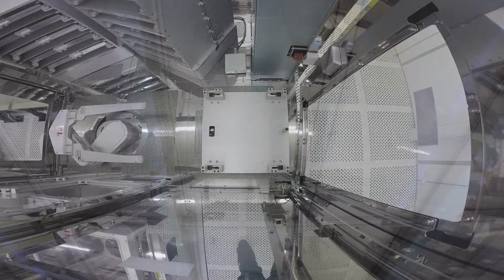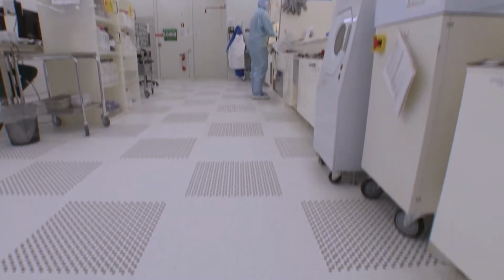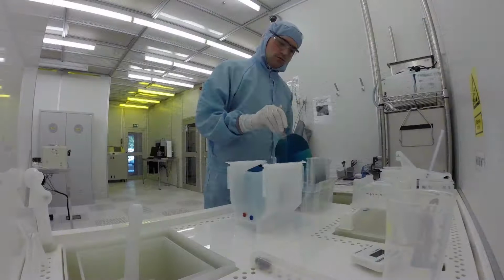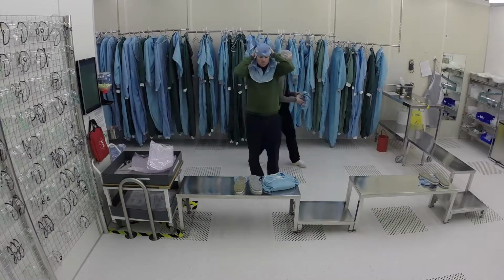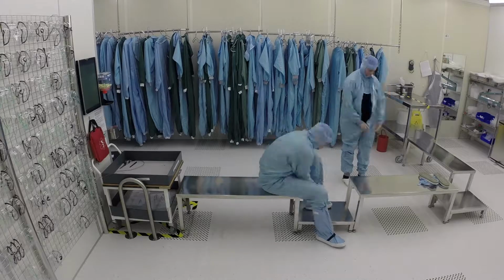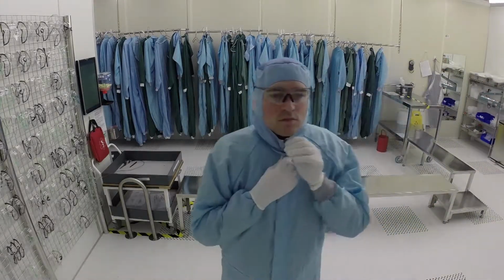This is done in part by our ventilation system. Filtered air is blown in constantly, creating positive pressure that keeps the unwanted particles out. It's also very important that as few particles as possible are brought into the room via people and objects. Therefore, there are certain requirements for clothing, behavior, and the cleaning of objects that are brought in.